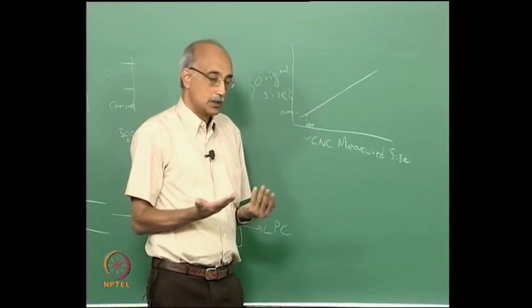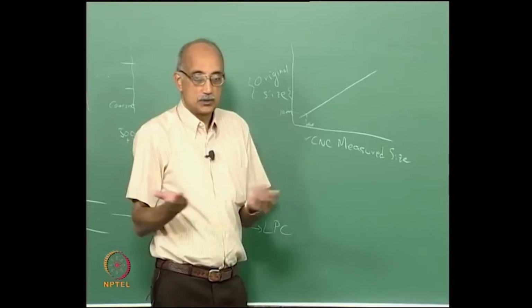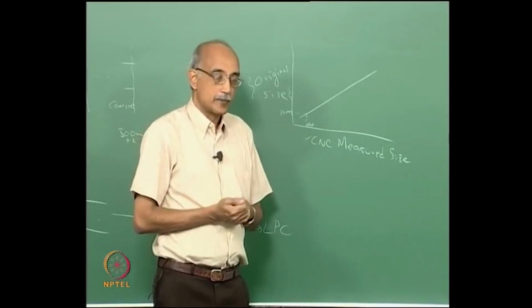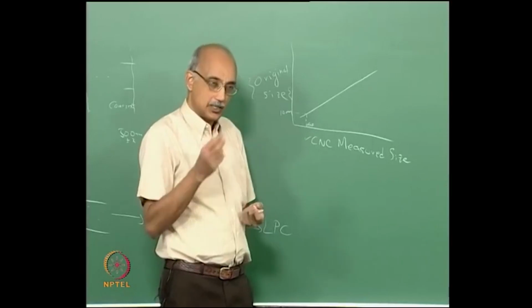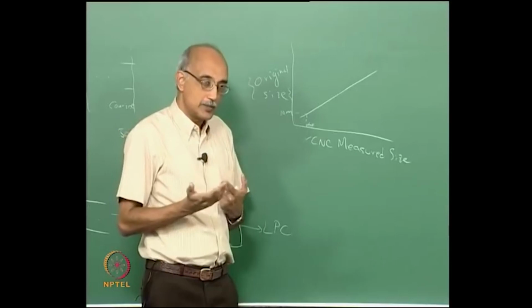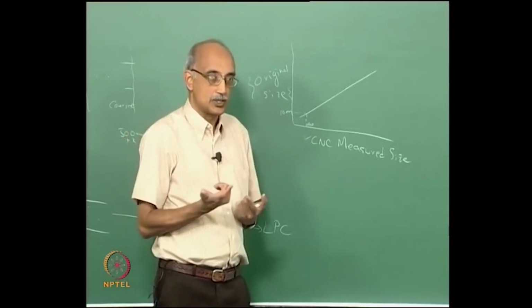For example, take this set of particles you have collected and use a transmission electron microscope or a scanning electron microscope with sufficient magnification and actually do size analysis. It's very painful, very time consuming, laborious, but you can do it as a one-time activity, as a calibration activity.